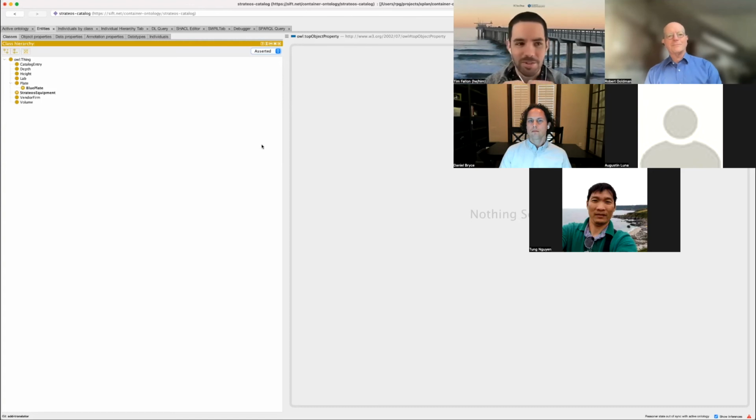Yeah, so I guess this all gets to the question, you can have a class that doesn't have any instances, I would suppose. Like you could have 50 milliliter beaker, and you'd be able to specify that in a PAML protocol. And you would also be able to say, what are all the 50 milliliter beakers I know about? But I'm saying, if you were to go to a typical glassware cabinet in a biological laboratory, it's probably a whole mix of different beakers, and people just pull whatever's available. So as long as it's a 50 milliliter beaker, however that is defined, it is suitable.